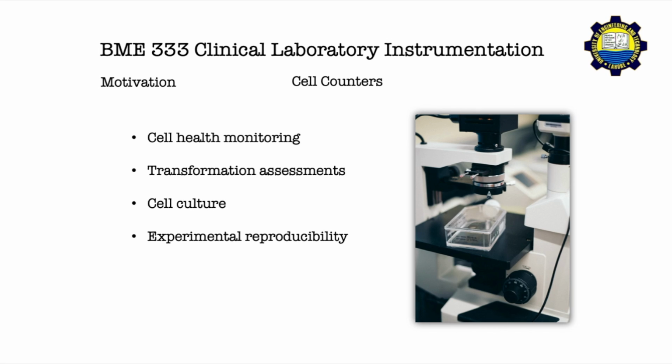So you could, for instance, be interested in monitoring the health of the cells. You might be interested in seeing how the cells behave over time. Their transformations could be important for a particular study. Sometimes you're growing a cell culture, or maybe there's a subculturing within those cells and you're recording cell growth over time, or the way cells behave in certain circumstances. So there are different applications regarding investigations of how cells behave, and you might be interested in different analysis.